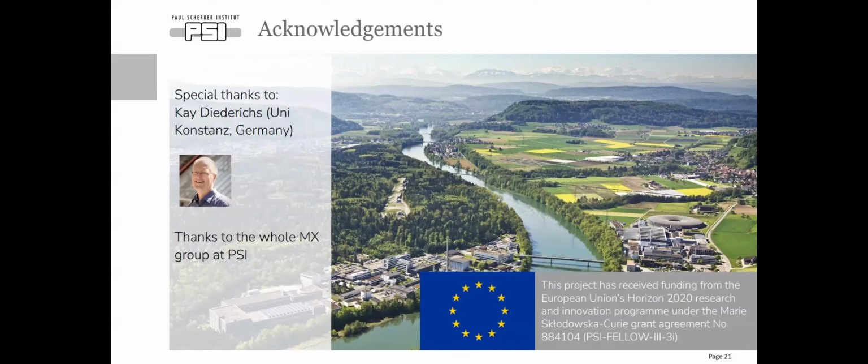You said that you can use delta CC1/2 for rejection of data sets, and in the case of serial data, we can consider every image like one data set. Is it possible to use that? I thought about it, but I haven't tried it because, from my experience so far, the contribution of a single data set, let's say we have 50,000 data sets like shots, is so small that I think there wouldn't be any effect to see, but I haven't tried really with numbers.